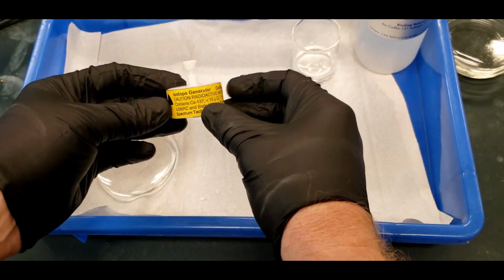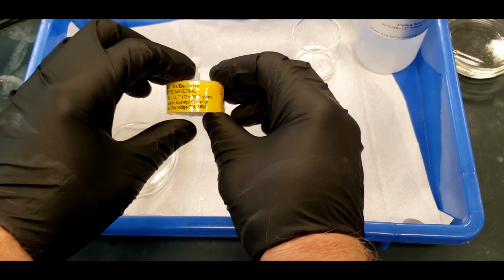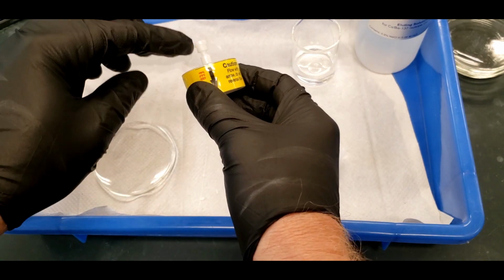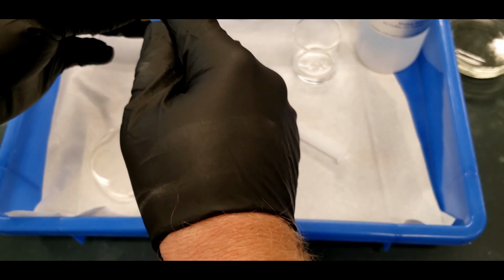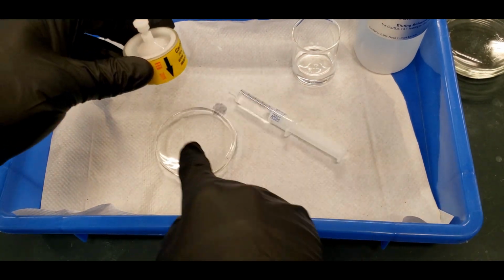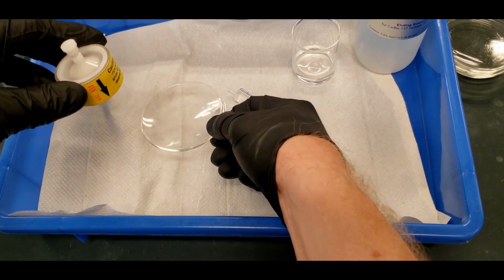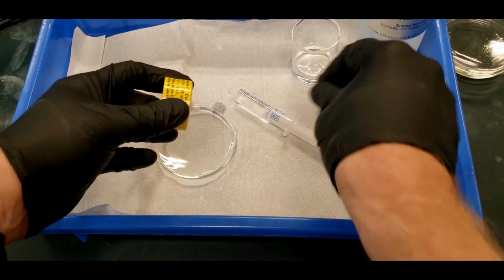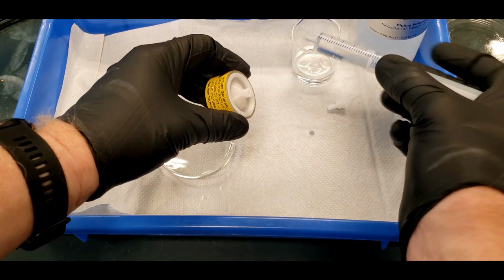Okay, here's our isotope generator. Cesium barium-137 metastable. And then see, this indicates the flow of the saline solution. We're going to put the syringe here on top. It's going to push the saline solution through, and then out the other side will come the dissolved barium-137 in drops, and we're going to put 5 or 6 drops onto the watch glass, and then that's going to go under the radiation counter. Okay, so we've got to take this off here, and this side off, and then put this here.